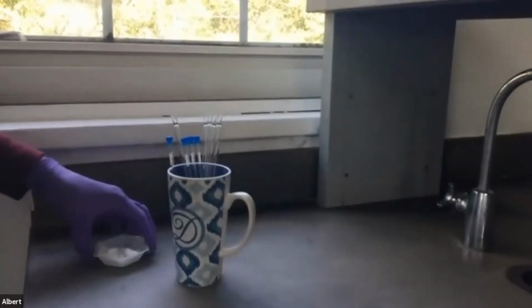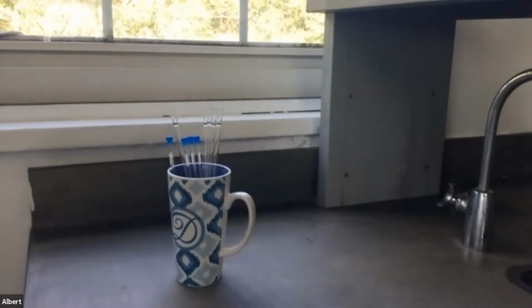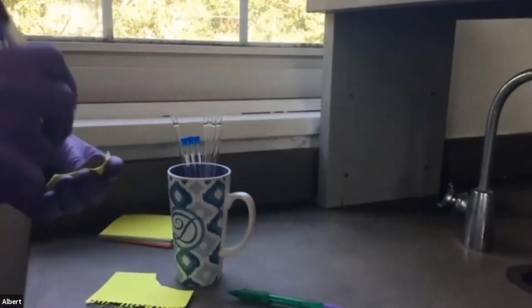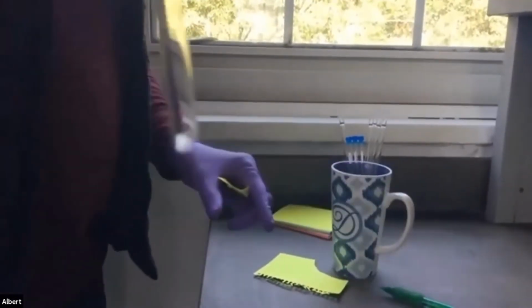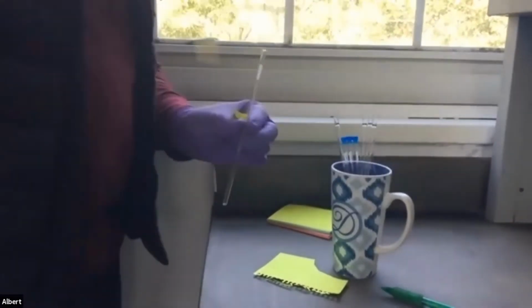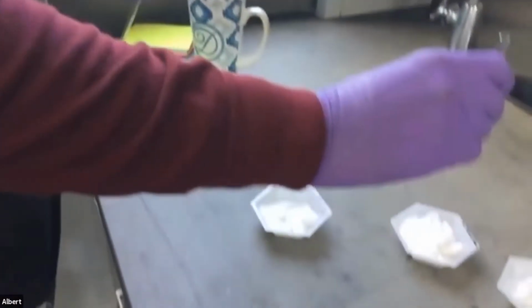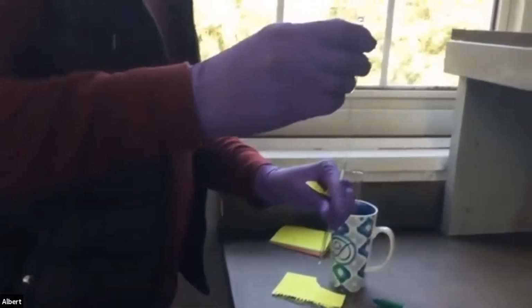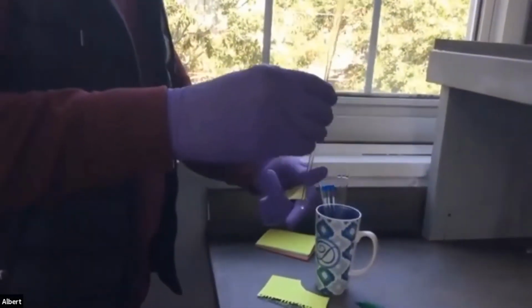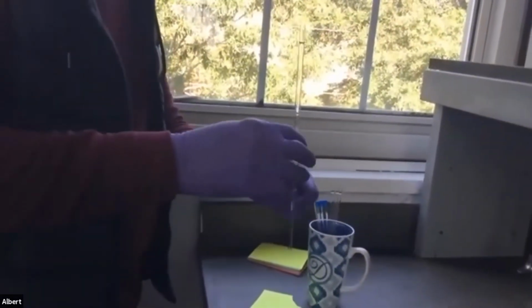So let's take sample. We're gonna take 3 NMRs. So get the crude and the sample 1, and we're gonna make up samples. So this is my crude sample. So normally when you have a solid and you want to take an NMR of it, you just take the tube, you take a pipette, and you just dip it into the sample. Right? So I'm dipping it here in the sample, and I'm gonna just take that and put it right into the NMR tube. I don't care if it goes down or not, because when I get downstairs, we're gonna add the solvent to this in order to push it through the pipette.